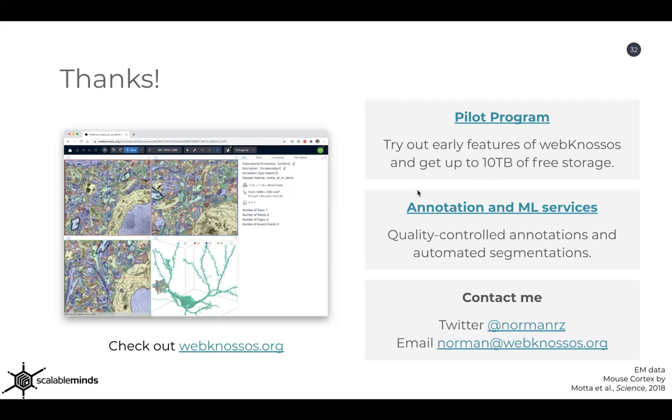Certainly, yeah. We haven't quantified that in the project yet. Typically, where we see more agreement is really where the image resolution or the image quality is much better. And if that's clearer, that will also be where the machine learning system later on will perform much better. So that will give you an indication.